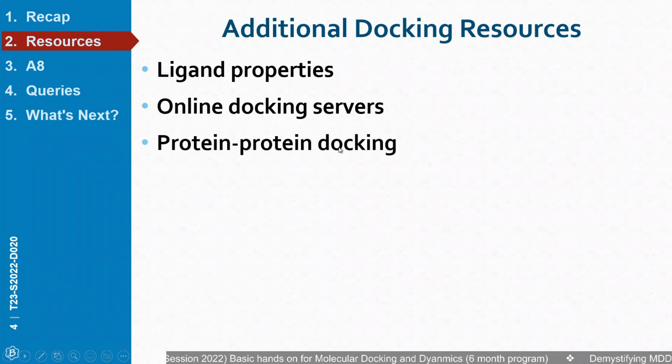Protein docking is also covered in this, or you can download PatchDock or any other software you find through your literature research or any other research paper, and you can perform protein docking. Actually, protein docking is important to help you understand how two proteins are going to interact in an environment, and maybe two proteins come together and form complexes that might be useful for your studies. So you can do that from here.